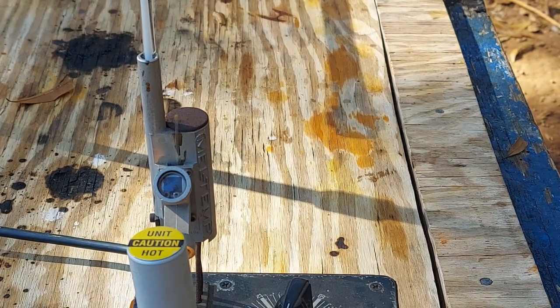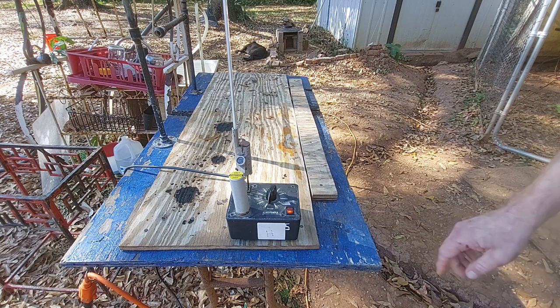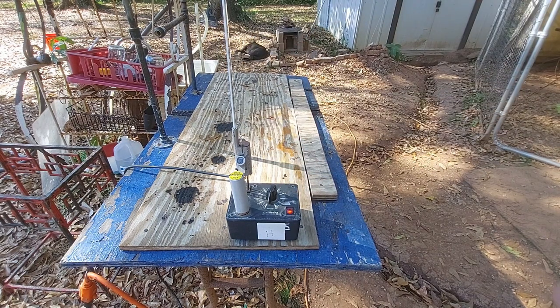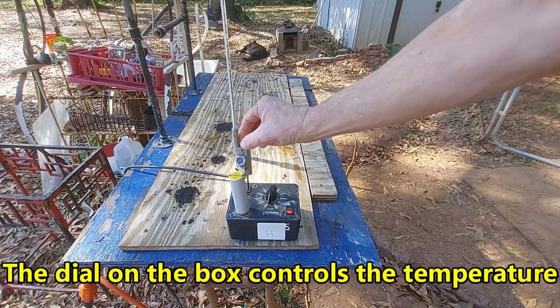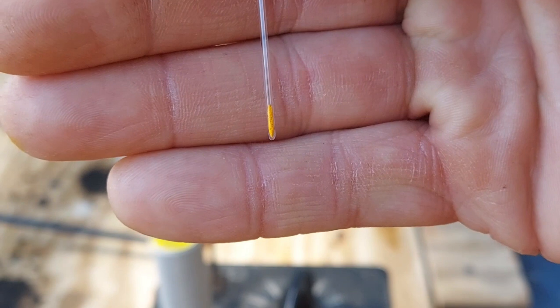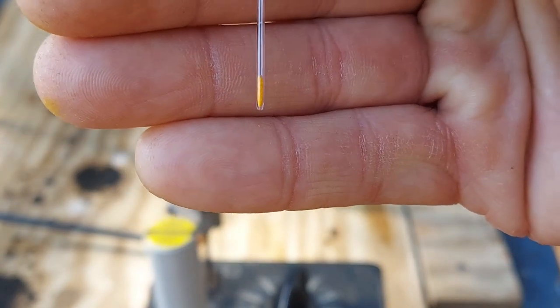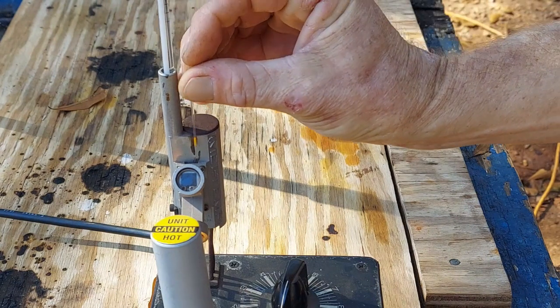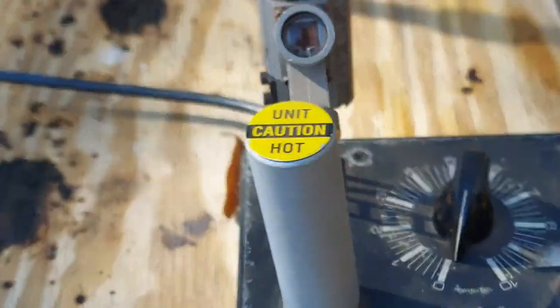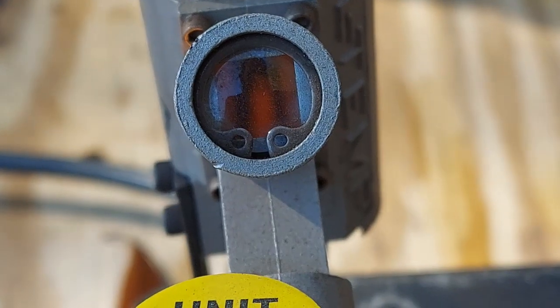Here is our handy dandy melting point apparatus. You can see just the body of the thing — the heating element is right here, we have a thermometer to keep track of temperature, and here is the little viewport where we can see the sample. There's our sample in a capillary tube that I fused with a lighter. We're going to stick that down in here like so.